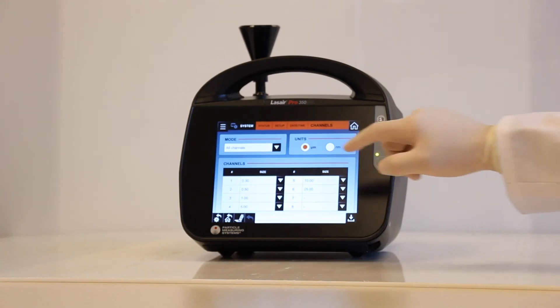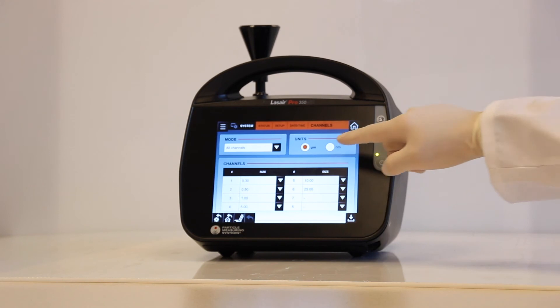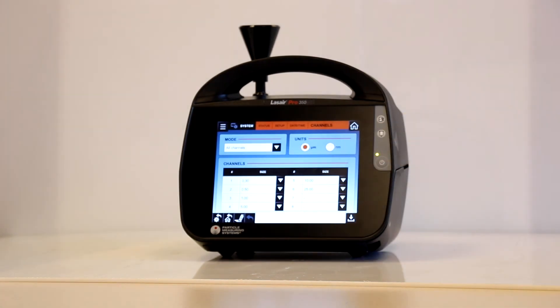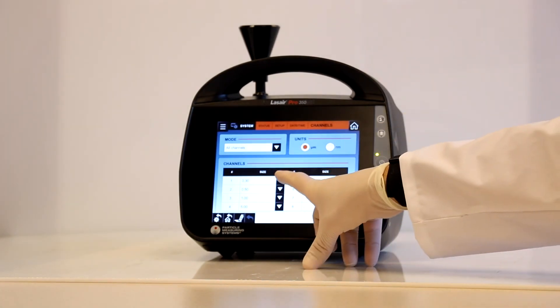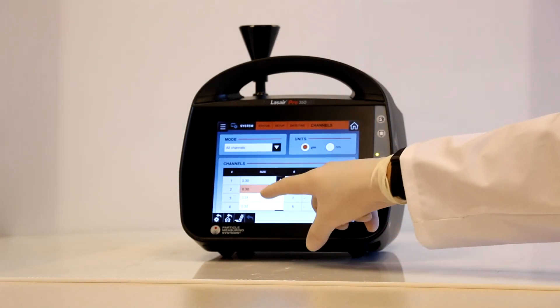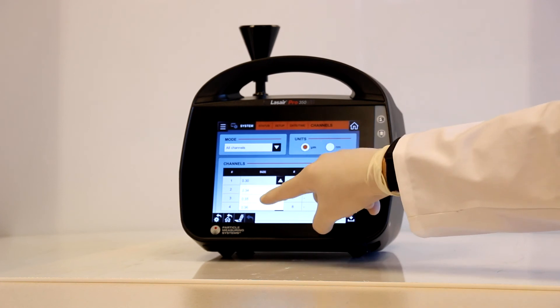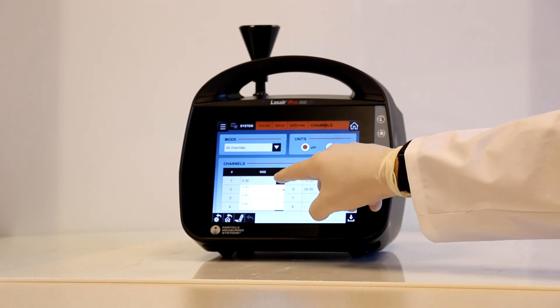This allows you to select between all channel modes or pharmaceutical mode, which monitors for only 0.5 and 5.0 microns. You can also select the unit of measurement, either micron or nanometer. In all channel modes, you also have the ability to select the channels you wish to monitor.